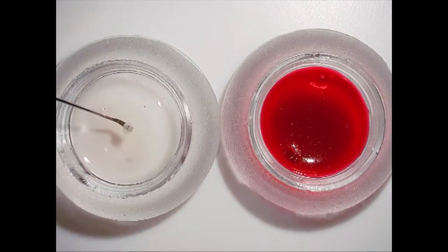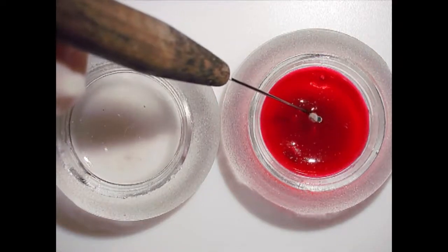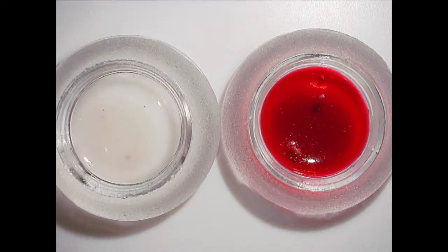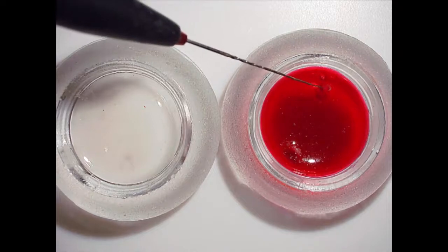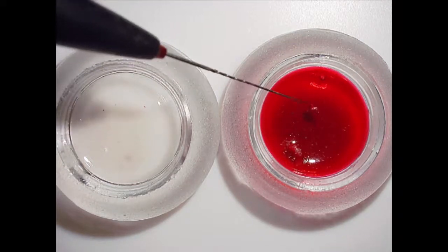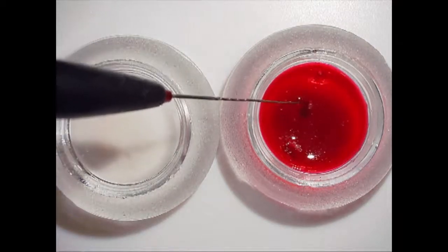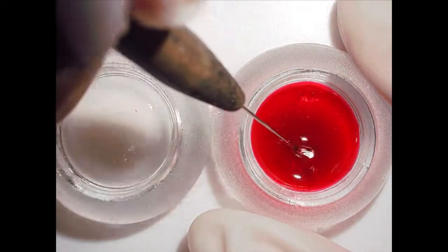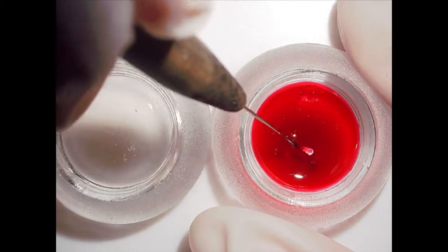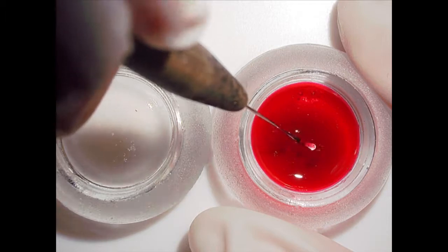Here we are taking the last specimen out of the KOH into the double stain. You may have noticed that when you place this specimen in the double stain, you'll see this bubbling action, bubbles forming in the integument of the specimen. This is something that you really shouldn't worry about too much. As I'm pointing to it here, sometimes these bubbles will eventually dissipate. You can probe the specimen occasionally, and that may help, as I'm doing here. If the bubbles don't dissipate, a little extra pumping with the micro spatula. I'm doing this just gently again, a little bit at a time. And there you can see the bubble is out to the side.